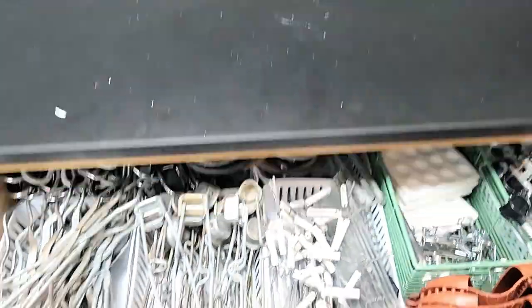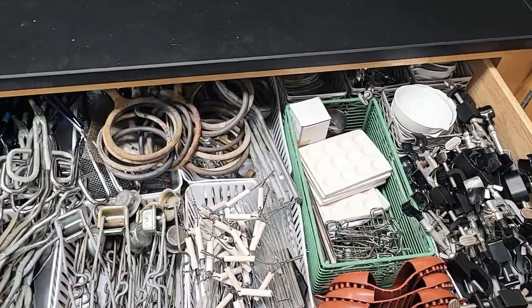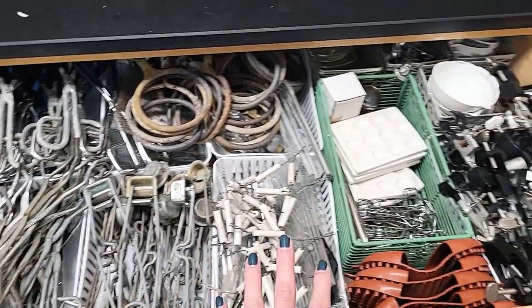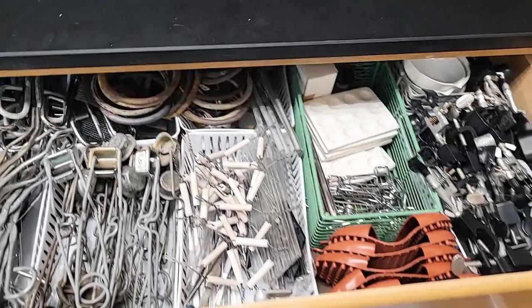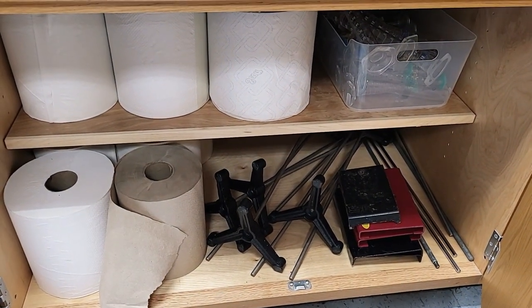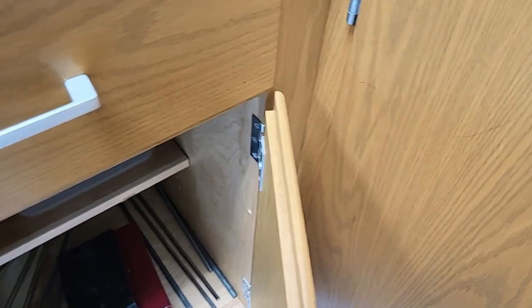And then over here, this is how I organize all my metal equipment that the students would need. So I'm going to have to redo my lab station. There's a lot more equipment in here than we usually would have, and it's just because there's nothing in the lab stations right now. And then for this part of the room, the last thing is I've got my ring stands and some paper towels and, again, extra glassware with graduated cylinders. So that takes care of this part where it's just equipment.